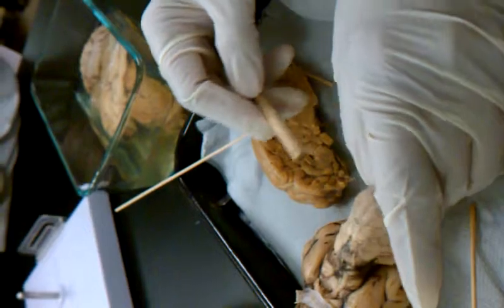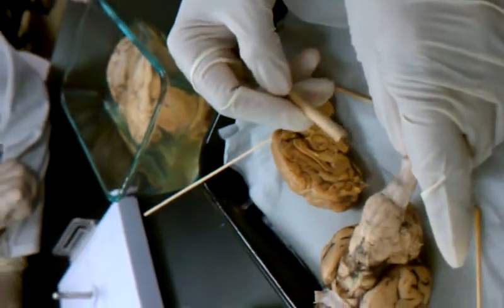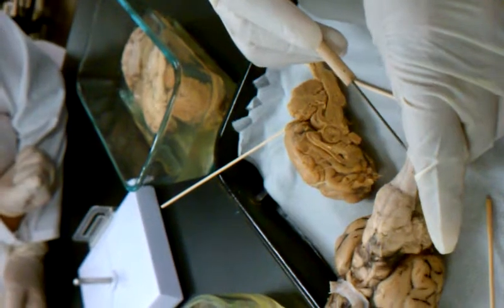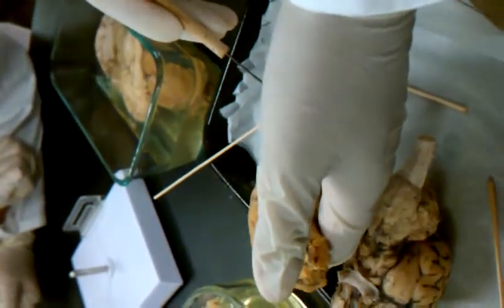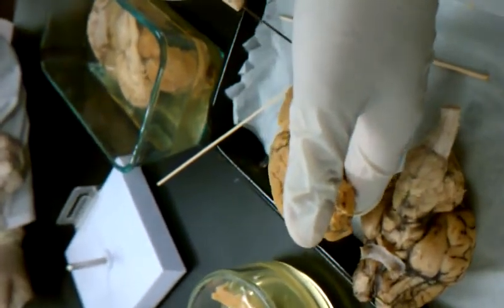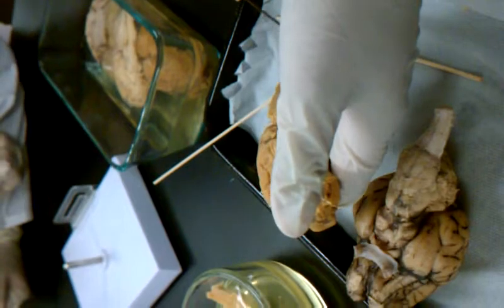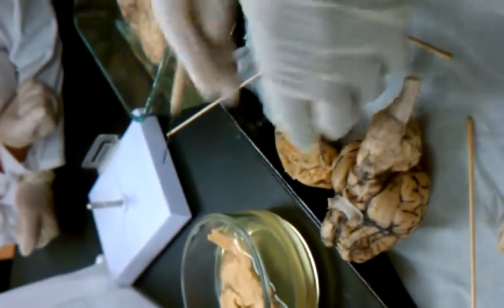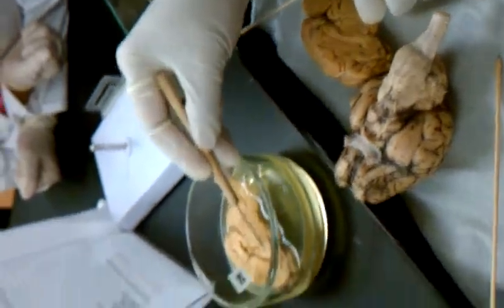Next. Okay. Medulla oblongata. Okay. Spinal cord is at the tip. If you see in the cross section, you can tell where the spinal cord starts. See? That's the central canal of the spinal cord. You have CSF in that. Next. Yeah, corpus callosum, you see this big C?